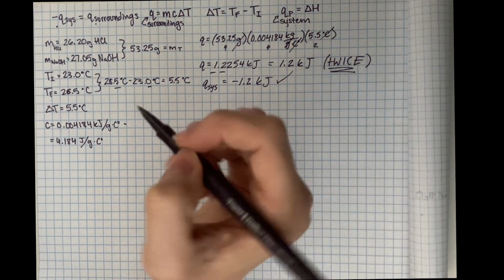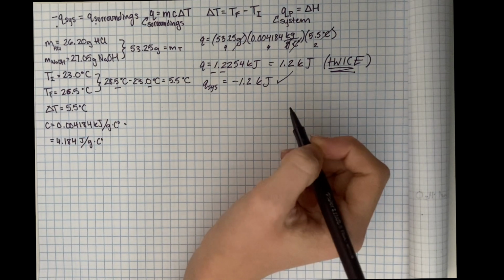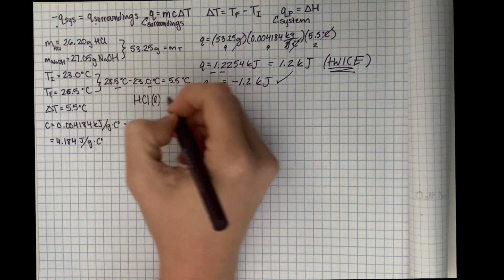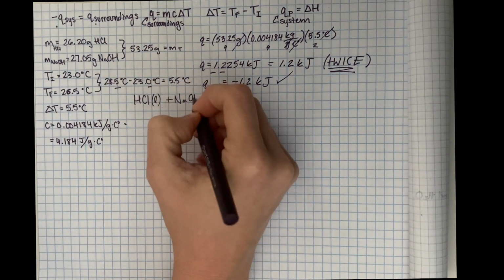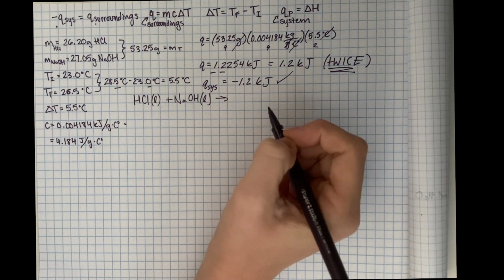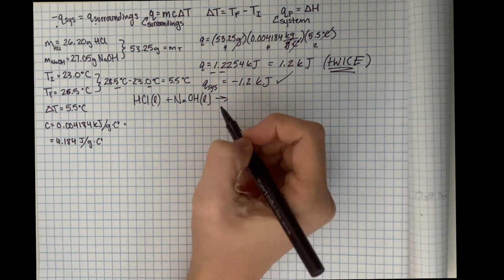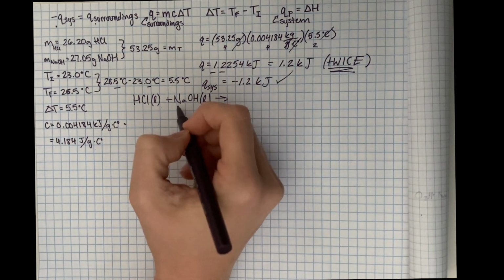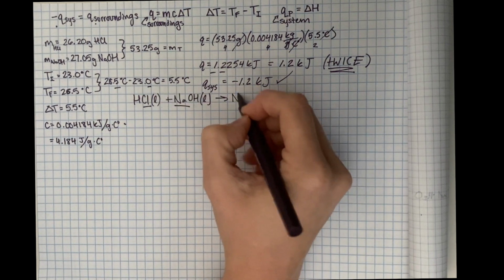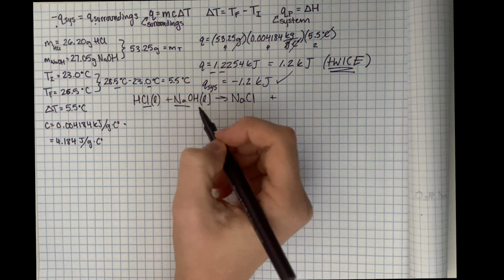So to know the product truly and to know some molar ratios that are important, we need our balanced equation. So we combined HCl in liquid form with NaOH, also a liquid. If you know your acid-base reactions, you can probably guess this easily, but if you don't, we can determine it as well. So, a normal double displacement idea: we take our cation and the alternating anion, so we get NaCl plus the cation and anion that are left over.